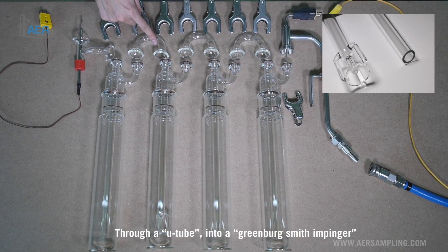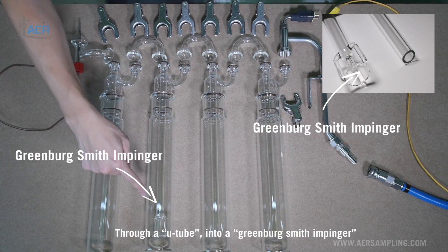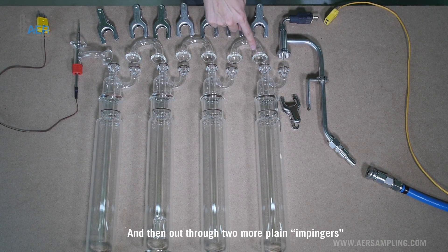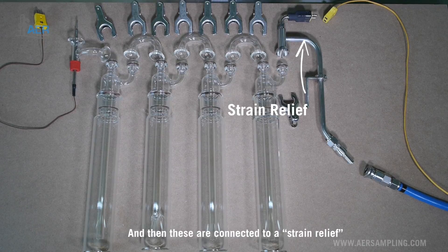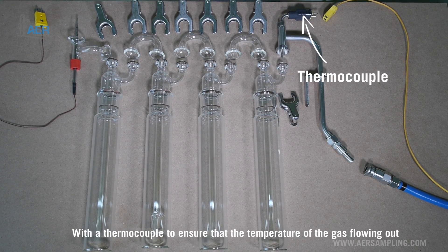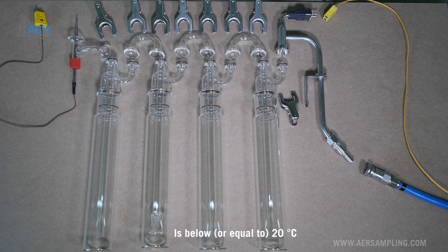The gas flows through a U-tube into a Greenberg-Smith impinger, and then out through two more plain impingers. These are connected to a strain relief with a thermocouple to ensure that the temperature of the gas flowing out is below 20 degrees Celsius.